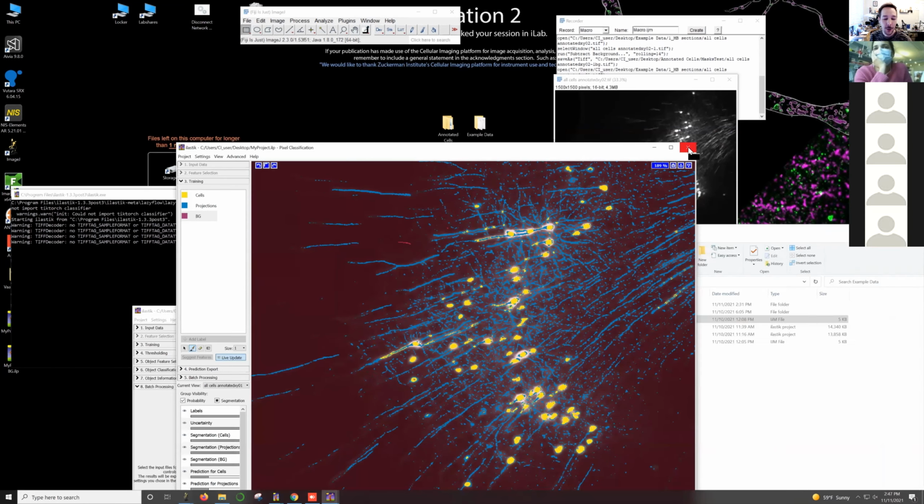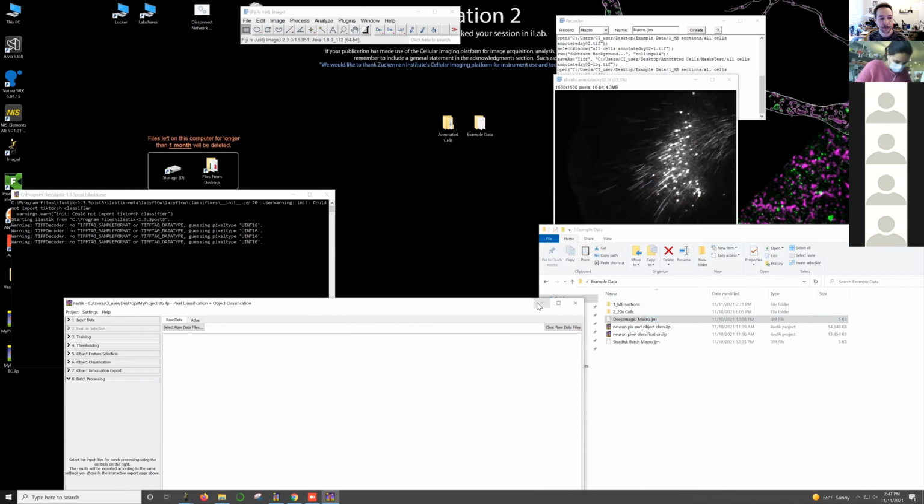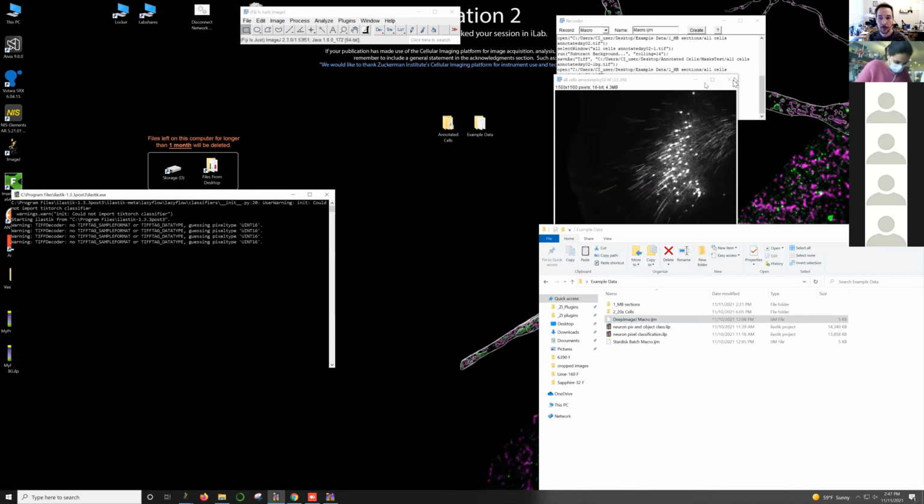What I also wanted to spend time on during this workshop was to show you how to use these deep learning tools, because they're incredibly powerful. And I think for many people, there's kind of a barrier to getting started using them. So I'm hoping that, in the short time we have today, we can remove some of those barriers so that you feel comfortable using deep learning in something as comfortable as Fiji. To start with, we can use an easy example, which is the StarDist cell detection tool.